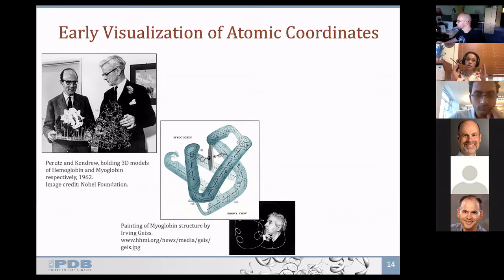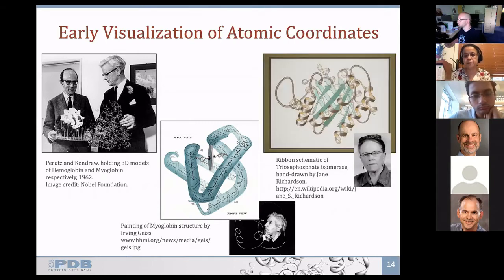Now, it was his ability to remove all the side chain complexity and just focus on the backbone that allowed us to see this sausage-like model and focus on where the heme is, what it is doing, and how it is able to bind and release oxygen.